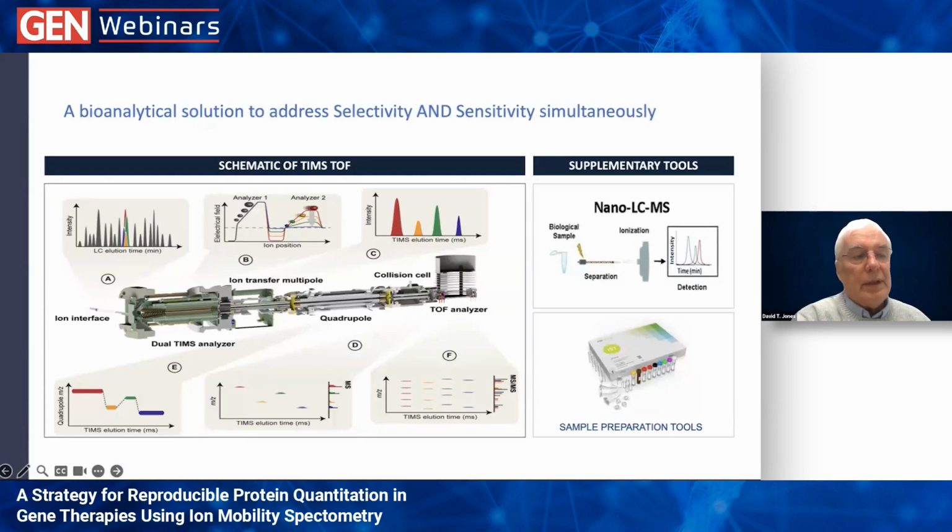It works with an RF field and a gas flow field to trap ions of a specific shape and specific charge and specific mass. So you're really cutting out all the stuff you don't want to see. And you can see thousands of things, but see them one at a time. It increases ion efficiency, and by increasing ion efficiency, you increase sensitivity.